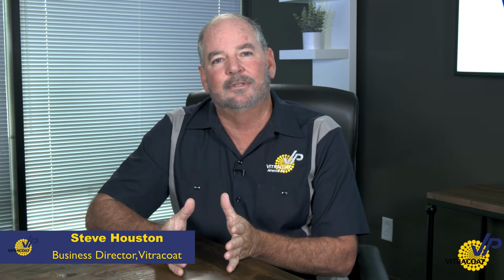Today we're going to talk about evaluating powder coatings and their physical characteristics. At the Innovation Research Center here in Houston, we have a lab that's fully functional and evaluates a variety of different elements of any powder coating product. What we're going to do is walk through some of those with you so you can see not only how we perform the tests, but how we evaluate the results.